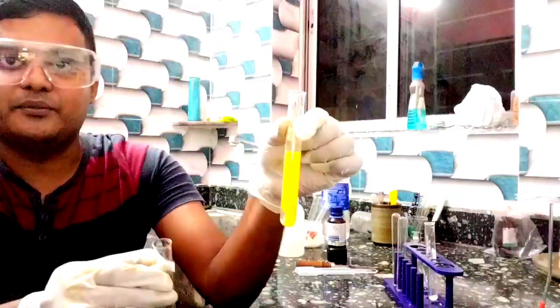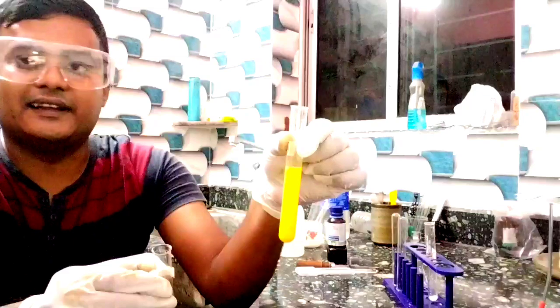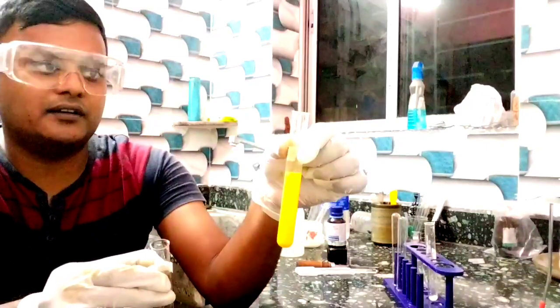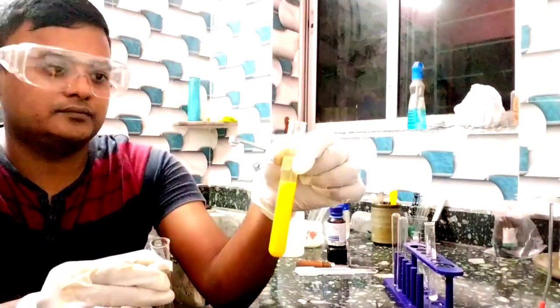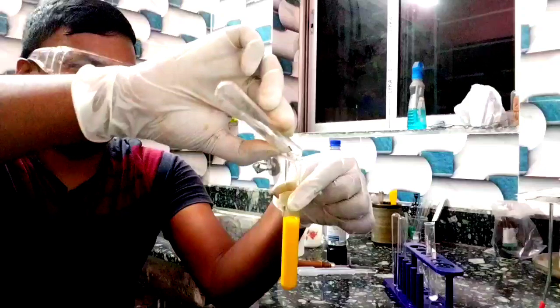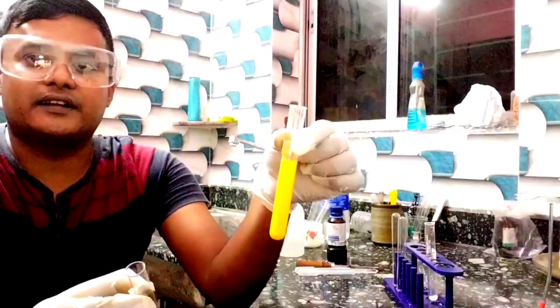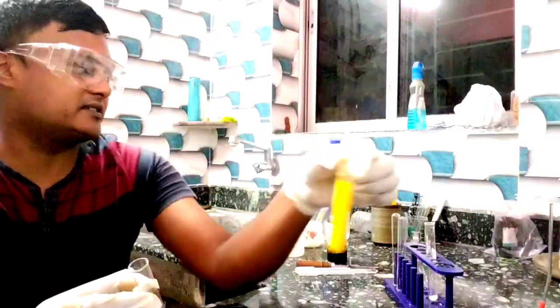See, bright yellow color of lead iodide! Bright yellow color of lead iodide. This is the detection of lead (Pb²⁺).